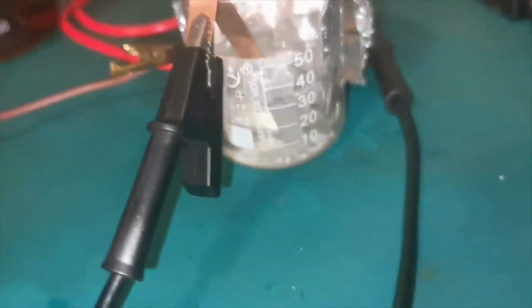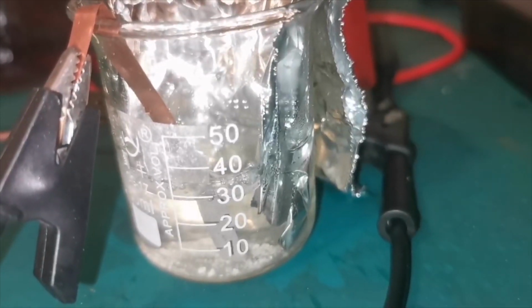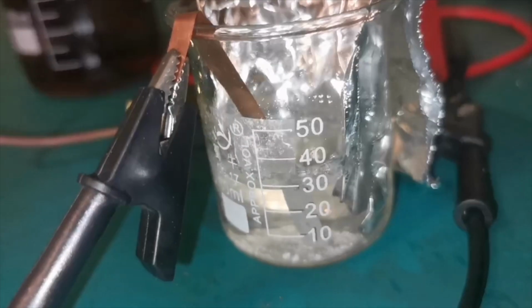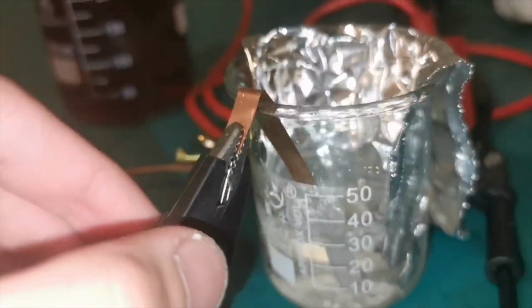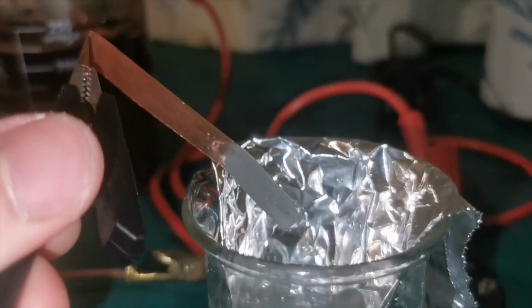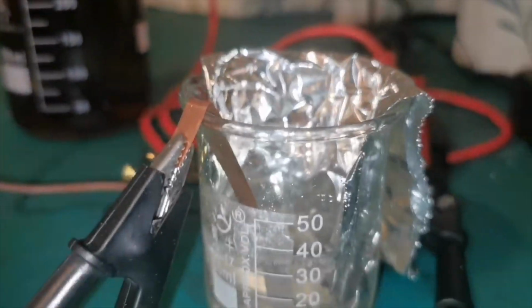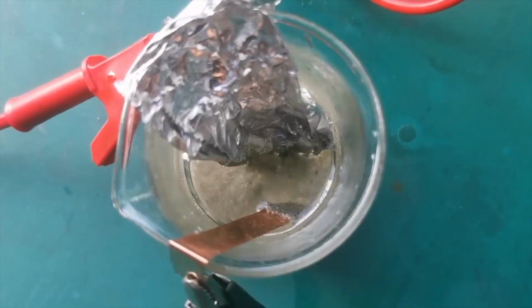If you don't have anhydrous aluminum chloride and still wanted to make sodium by this method, you can start with a kickstart lithium cell, wait until it produces lithium at a fast rate, and then switch out the lithium chloride input for sodium chloride. The sodium metal product will be contaminated with a little bit of lithium, but that doesn't impact most uses. Anyways, the electrolysis continued uneventfully.